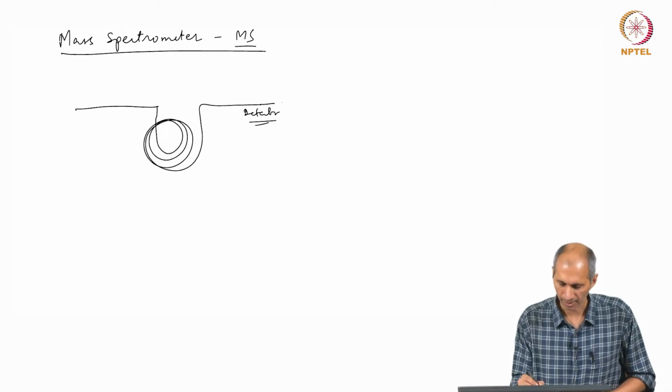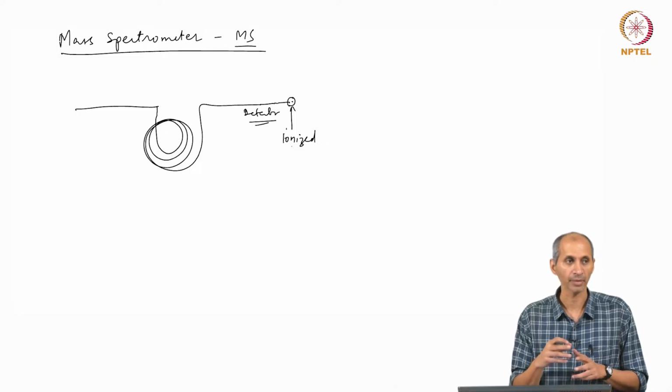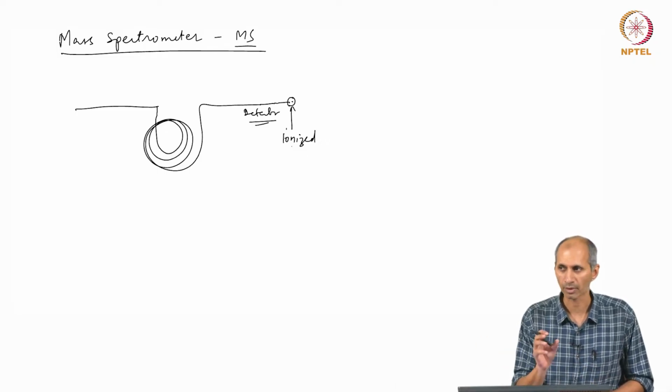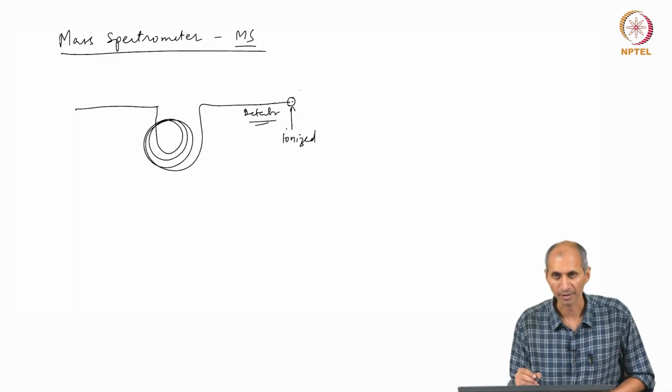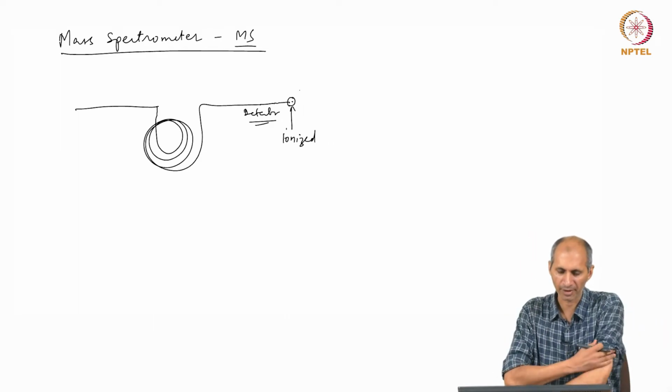What happens in the mass detector is that anything that comes into the detector is ionized. So, essentially it is ionized and fragmented, broken into small segments. I am just trivializing the theory of it. Mass spectrometry is a very complex field.